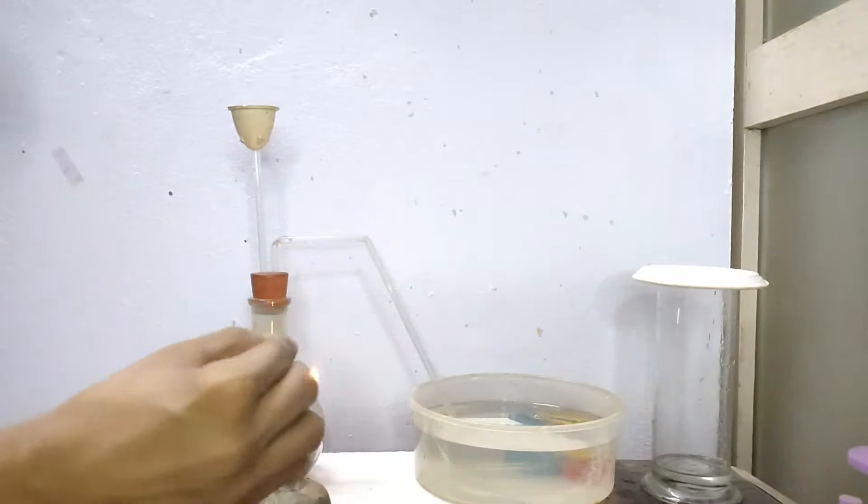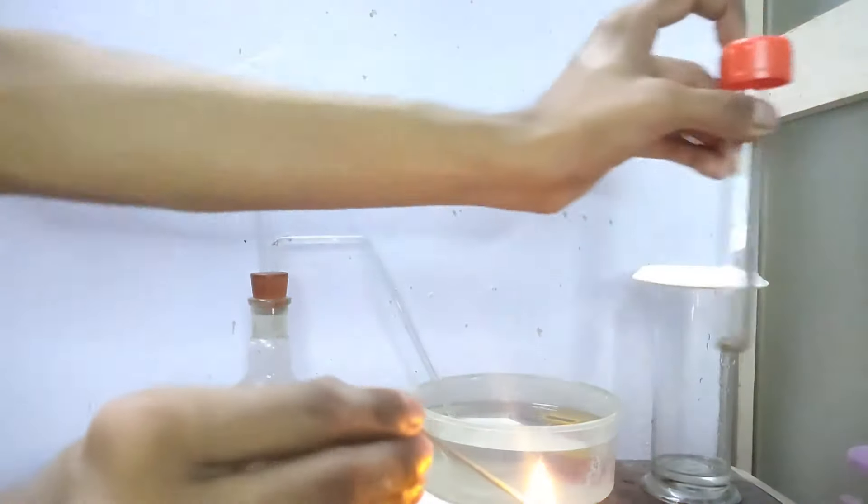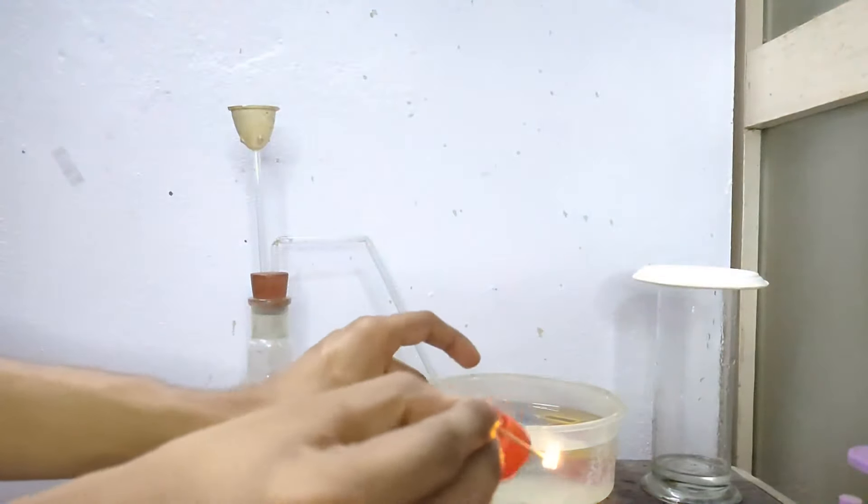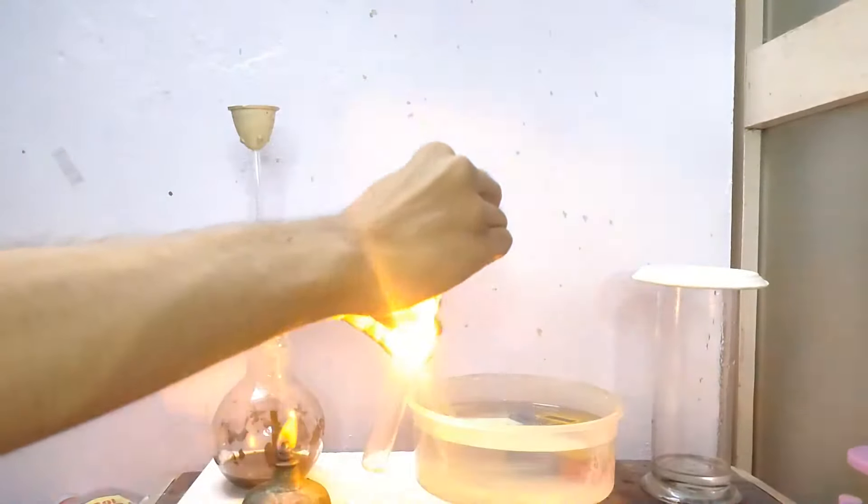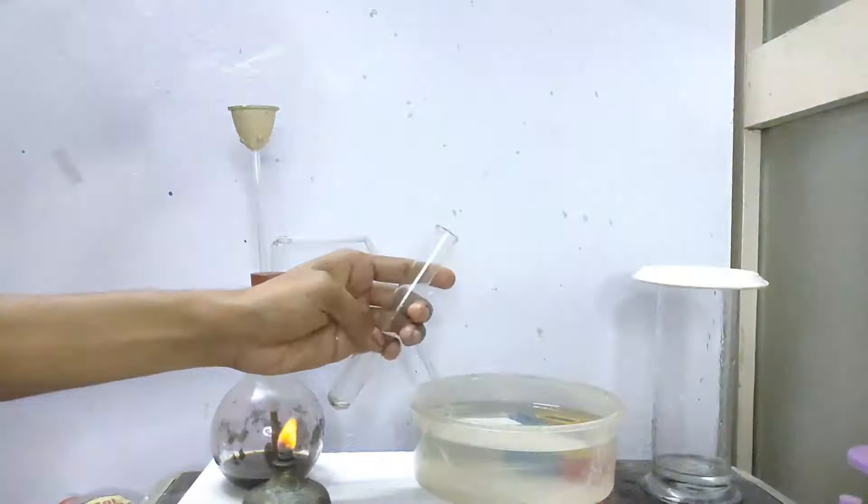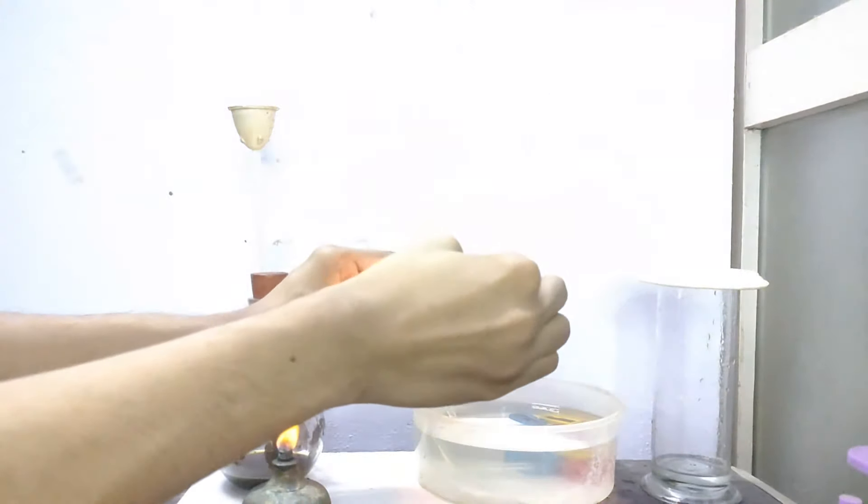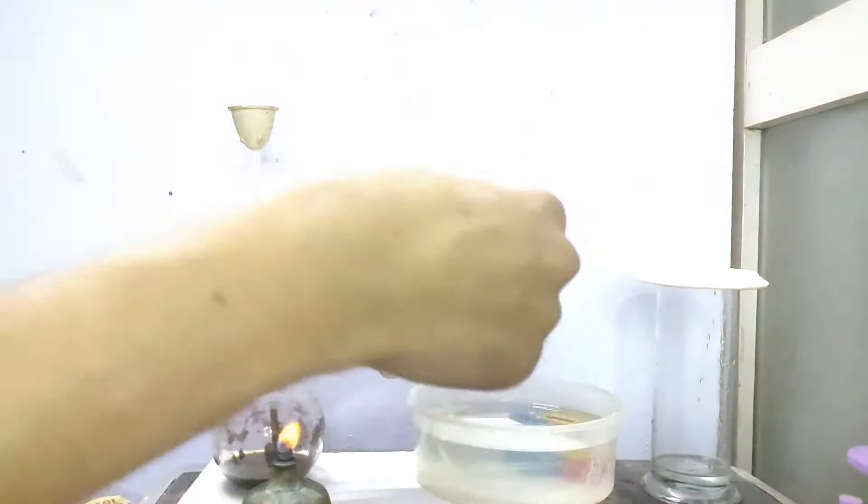Now to show you the test of oxygen, I will take a burning splinter, extinguish it to blow out the flame and insert the glowing splint inside the test tube with oxygen gas. And you can see that it rekindles. This is the test for oxygen.